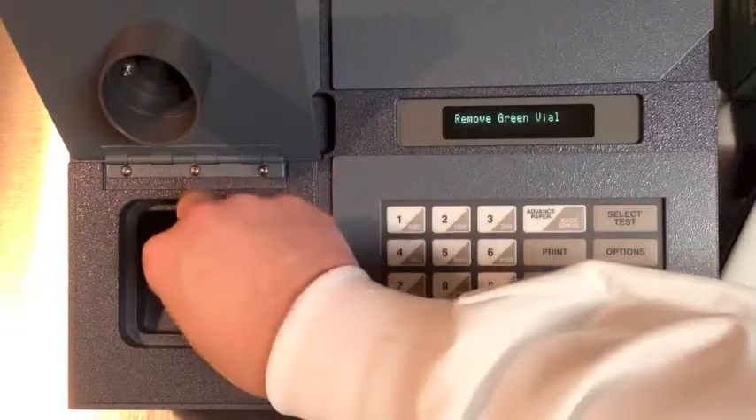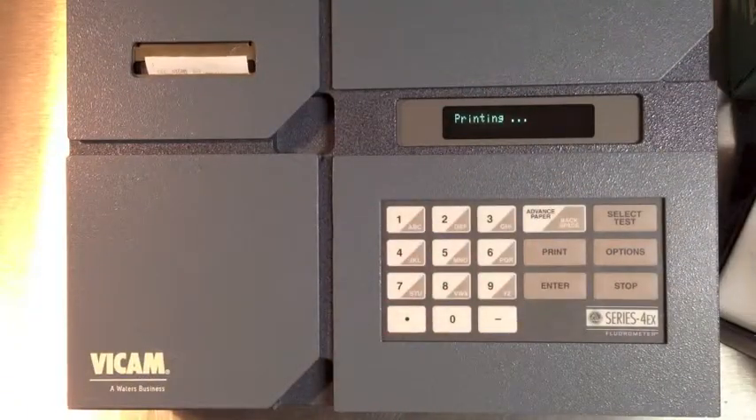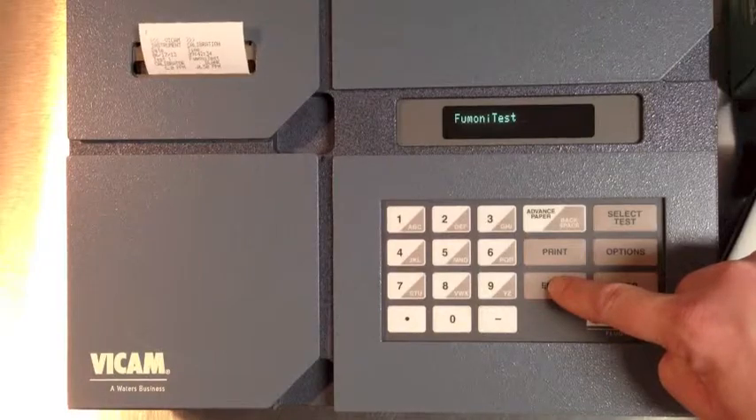The machine will now print a time-date stamped record of calibration. To test the calibration, we will run a known sample with the yellow vial. Press Select Test and choose Fumani Test by pressing Enter.